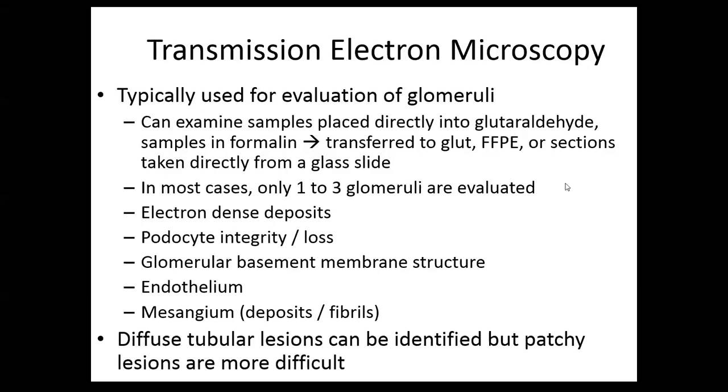The other thing we can do, which we're doing right now for a case that came as a consult from Penn, is they had already looked at the paraffin block. So they had formalin fixed paraffin embedded tissue, and they had looked at the glass slide, and then they sent us the block, and we are melting down the block, and we are taking those cores from that block, and we are post-fixing it in glutaraldehyde.